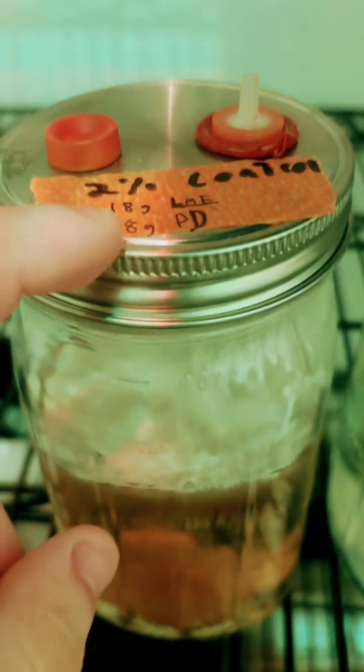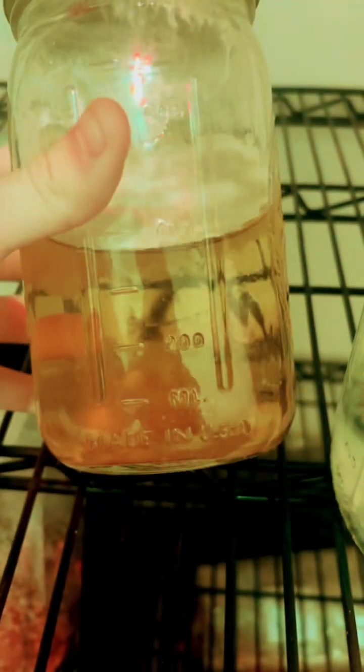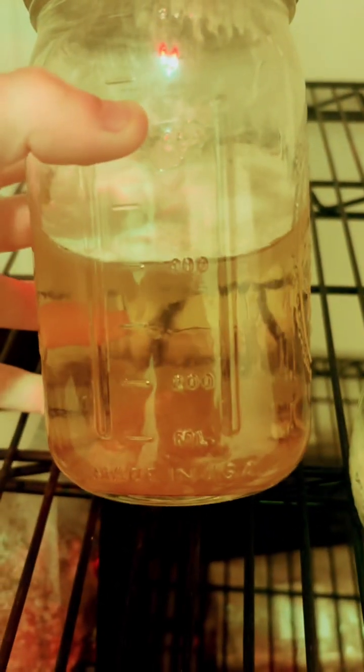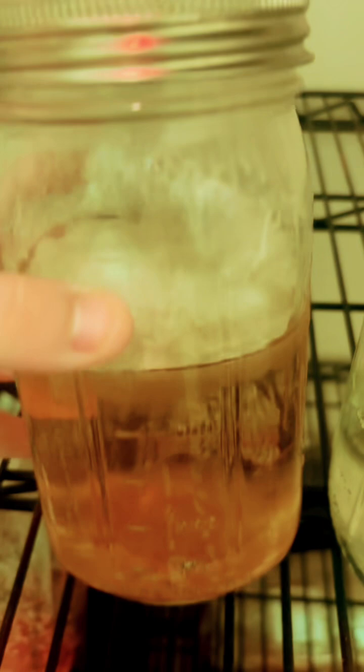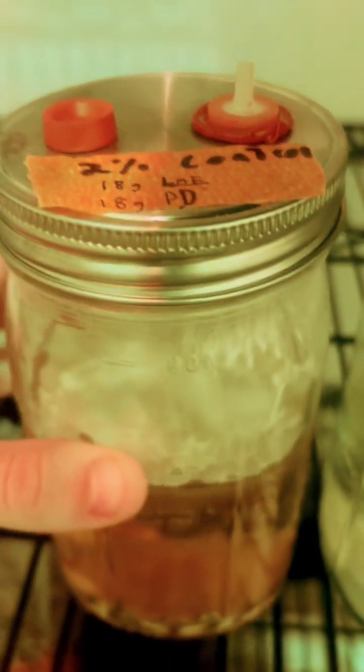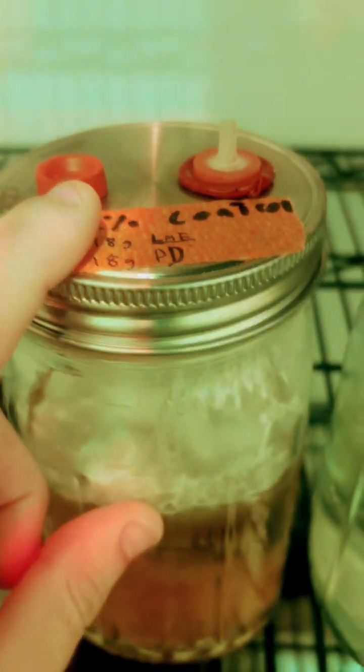So this is the 2% with our normal recipe. As you can see, this is our normal liquid culture. This has the most growth by far.